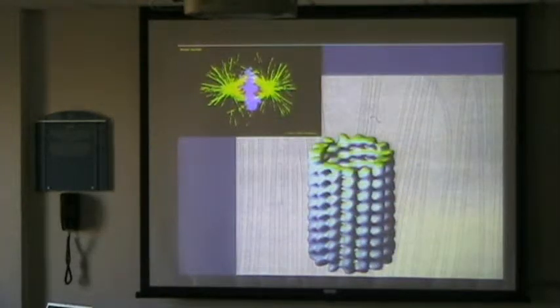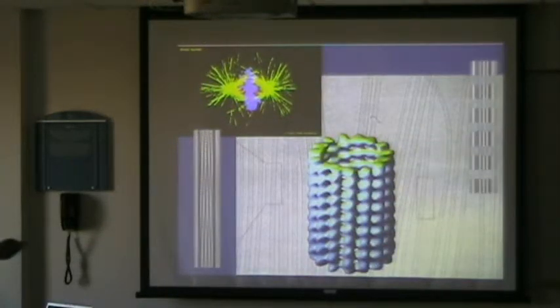So these again are these kind of microtubules. This is the way you would see them in a light microscope, so you can detect a microtubule easily with fluorescence. Single molecule detection is no big deal these days anymore in a light microscope, but it does not give you a structure, right? It gives you a detection. It tells you here is a microtubule, but it doesn't show you how the microtubule really looks like, except maybe for the lengthy shape.